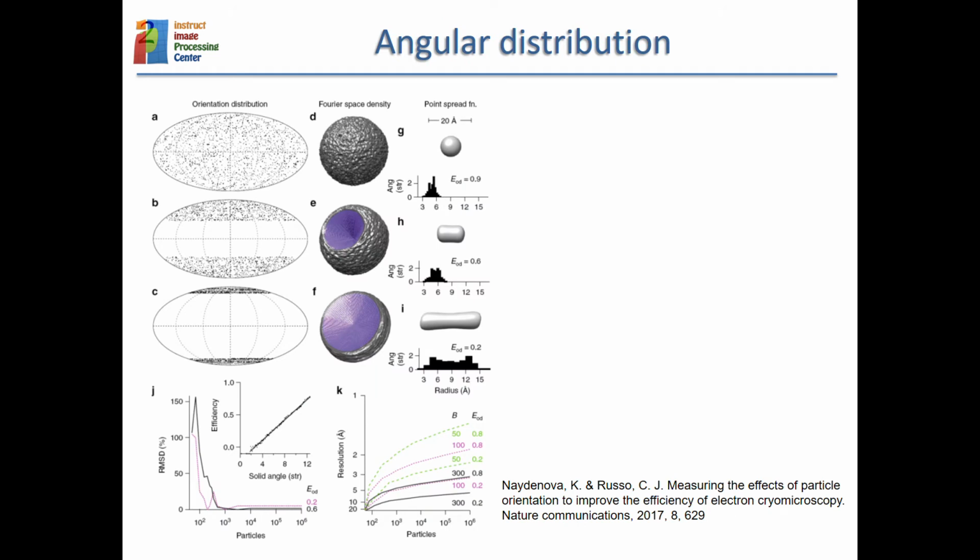And there have been some proposals to put a number on how good the angular orientation distribution is. This is CryoEF, I think it is the name of the program, and it is also incorporated in Scipion, so there is a plugin, and you can compute for a particular angular distribution how good it is. The closer it is to 1, the more uniform it is, and the closer it is to 0, the less uniform it is and the more areas you are missing.